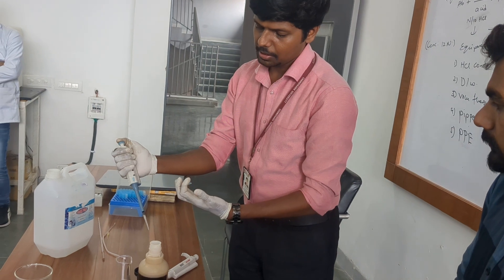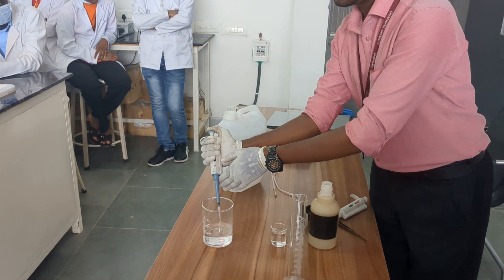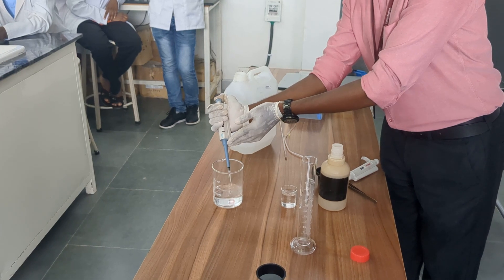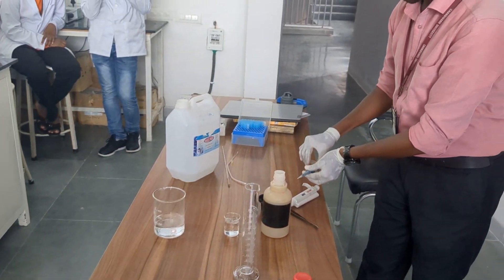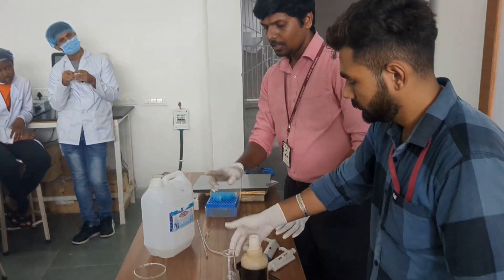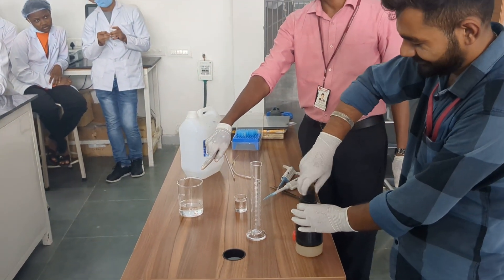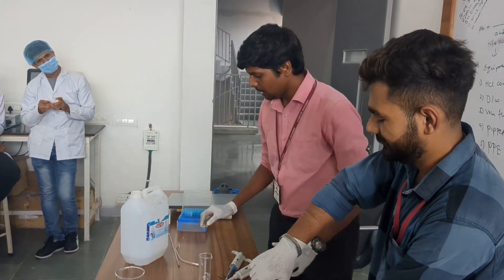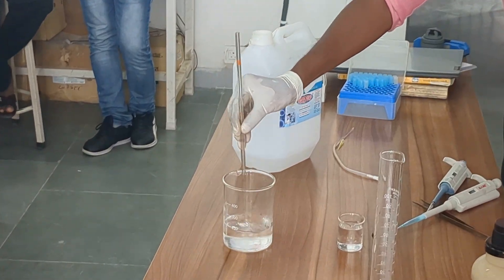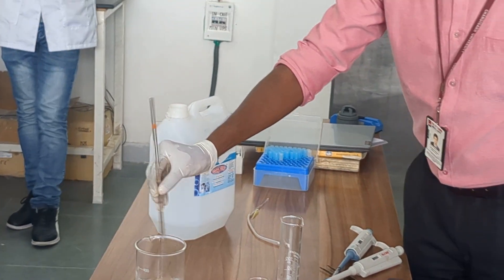There is a lot of reaction happening. I am already feeling heat from the acid reaction. Always be cautious. Now we have added 150 ml of water and 2.08 ml of concentrated HCL. We are now going to make the volume up to 250 ml.